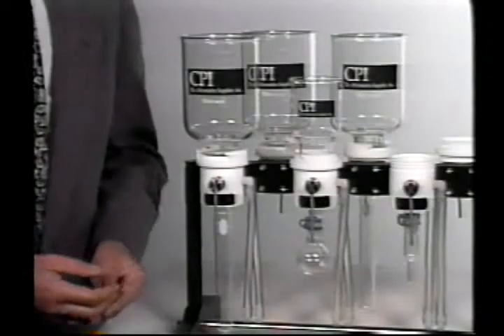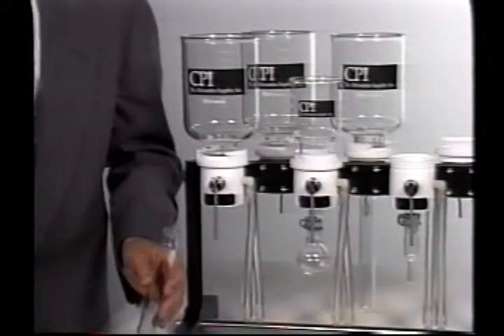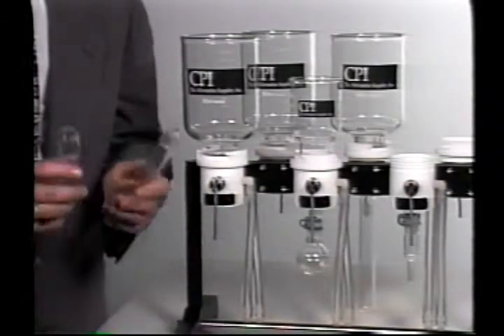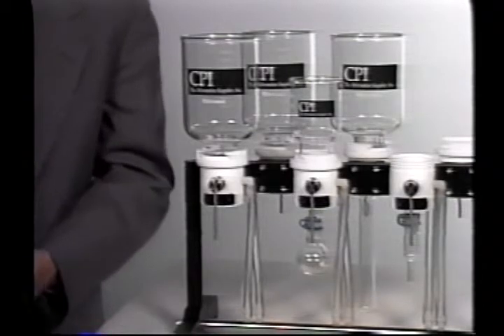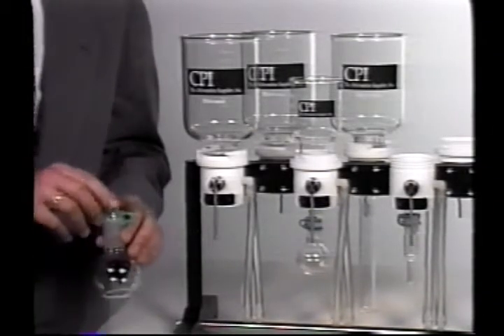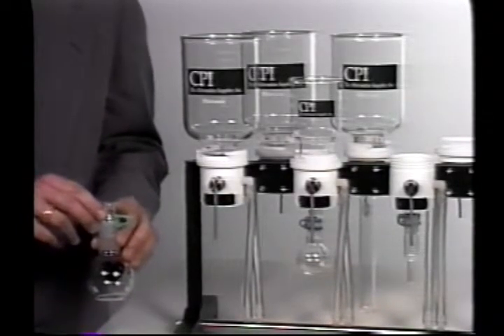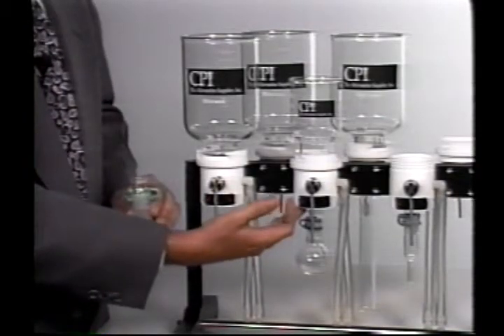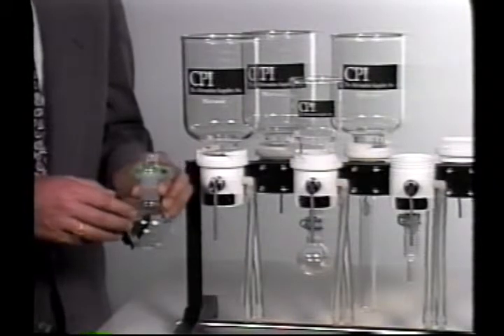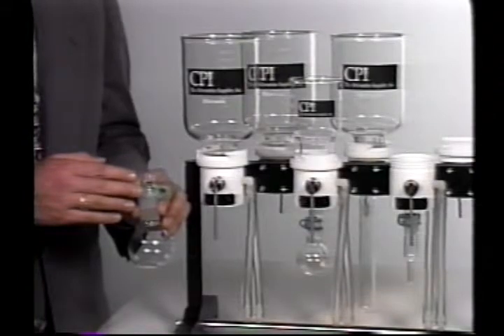Any standard VOA vial can screw right into the base of the extraction station — whether you want to use the hundred milliliter VOA vial or a forty milliliter VOA vial, these are both very standard items and completely compatible with the manifold. In addition, we have glass joints of either 24/25, 24/40, or 19/22 that also can be fitted into the bottom of the manifold, and this gives you the flexibility of using any sort of boiling flask or collection vessel which you are accustomed to using in your lab and which is most appropriate to your technique.